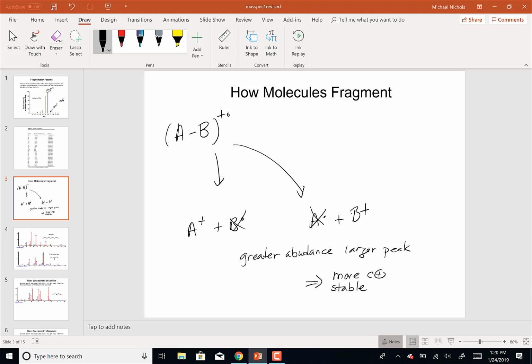The rules for mass spectrometry as far as carbocations go are different than in lecture. In lecture, you lose points, maybe lots, maybe a few, if you write primary carbocations. Usually it's just an X through it with a "oh no, a primary carbocation!" That's how I do it.